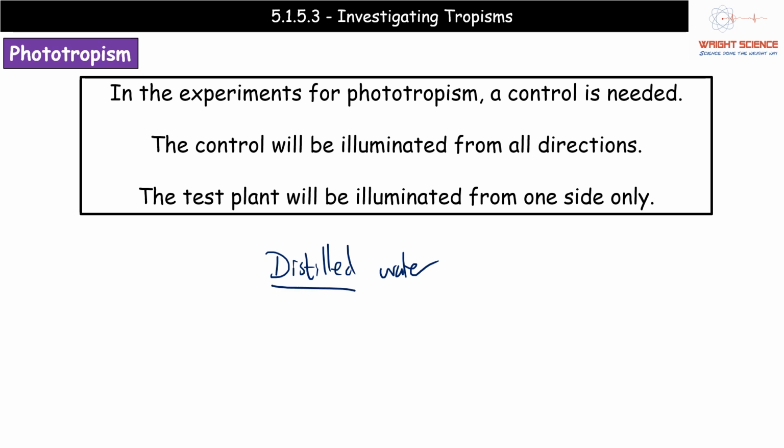Second thing is to make sure that you talk about mixing before you take the next sample, because remember, in a serial dilution what we're going to have is our first tube, which might be our 100 parts per million, then we're going to be diluting down to 10 and to 1, etc. And what we're going to be doing is taking from the previous tube in each case.